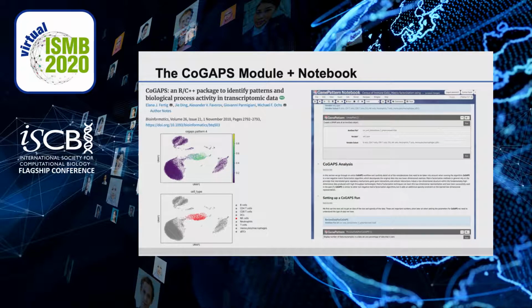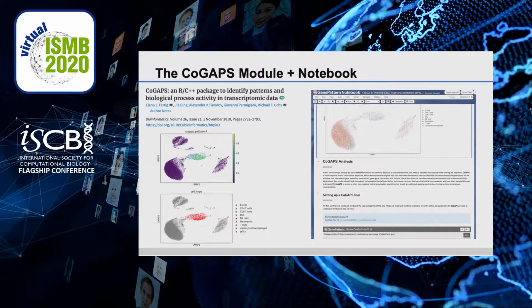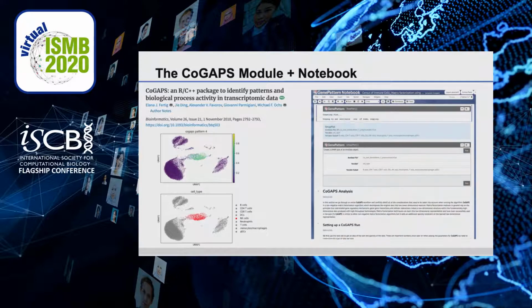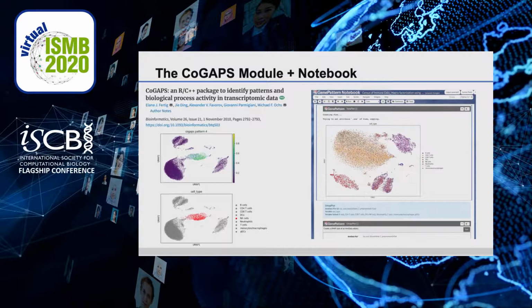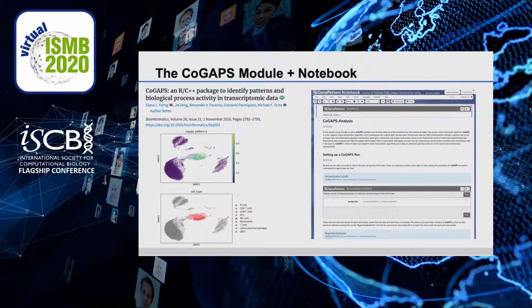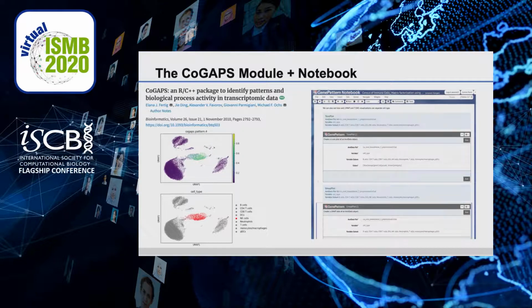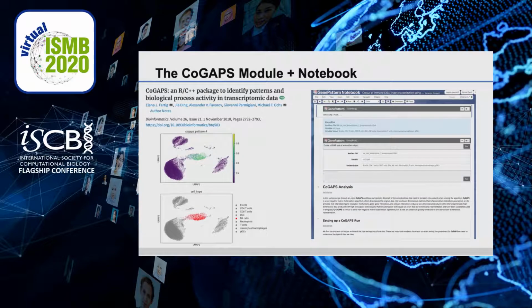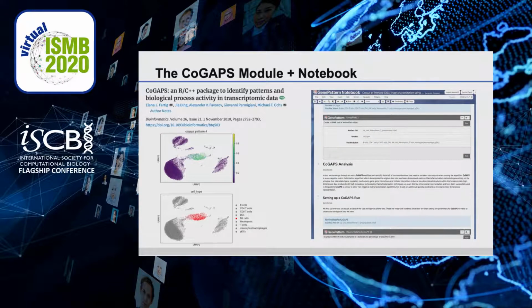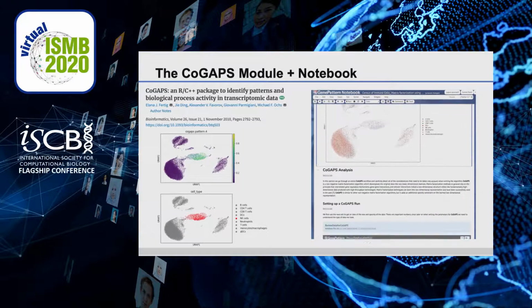The CoGAPs workflow is implemented in different GenePattern modules embedded throughout the notebook. Each module has configuration options for the figures and instructions above it to guide users in selecting those parameters. When executed, these modules send their data and parameters to the GenePattern cloud server. This is crucial because some CoGAPs steps can take several hours. While these modules are running, users can close their notebook and the module results will be waiting when they return.